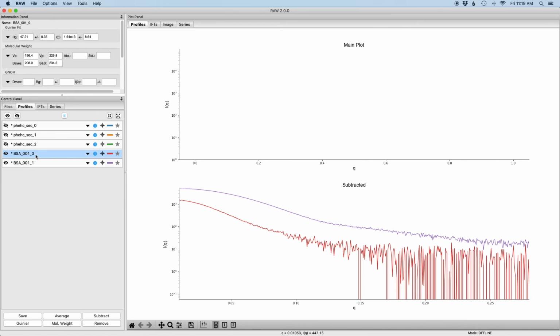We don't have to use the whole range of the data set. If you have something very complicated, if you have 4 or 5 things that are eluting, if you can isolate it to just 2 or 3, that can really improve your EFA.